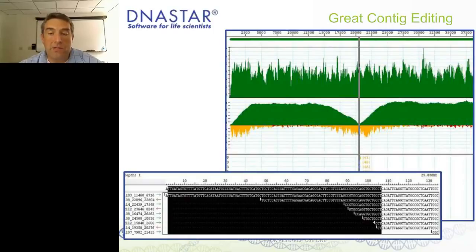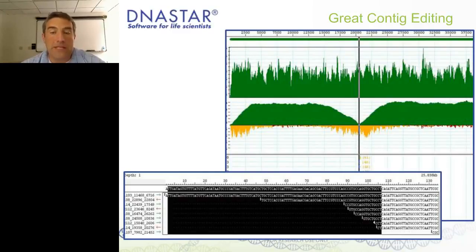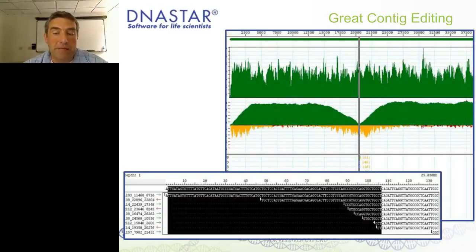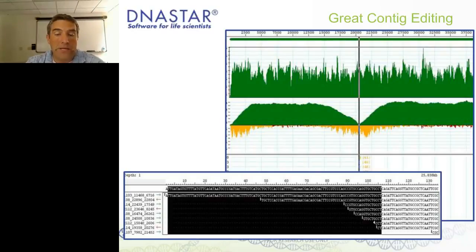We can also do contig editing. Micro editing is at the base pair level, but I can also look at contig strategy views — usually where I start. I scroll through them quickly and if there's a problem with a contig, it shows up clearly with a region where pair consistency doesn't exist. That's a strong indicator of a problem. I can place my cursor in that spot and use the menu to split the contig into two pieces. I can also look at contig ends and trim off noise from bad or chimeric reads.